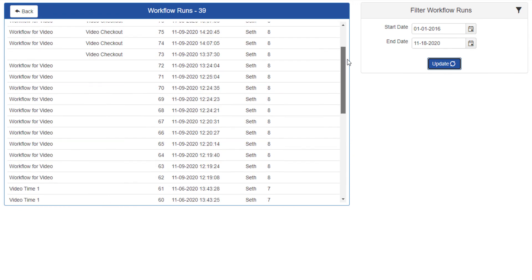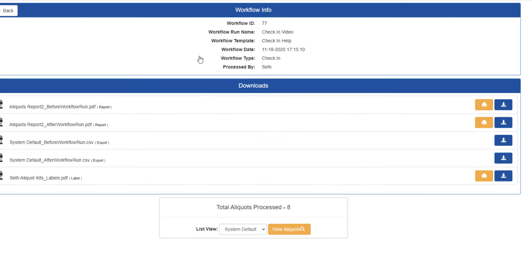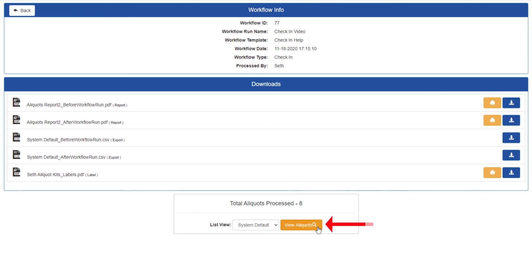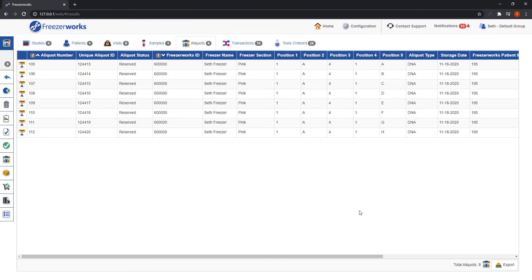Opening a workflow history form should look a little familiar. All of the information about a workflow is contained in its history record, including all of its deliverables, which can be re-downloaded or reprinted at any time. You can also pull up the aliquots that you ran the workflow on by clicking view aliquots. Remember earlier when we needed to find the aliquots I checked out in the last video? We could have actually just come to the history record and clicked view aliquots. That's how helpful workflow history can be.